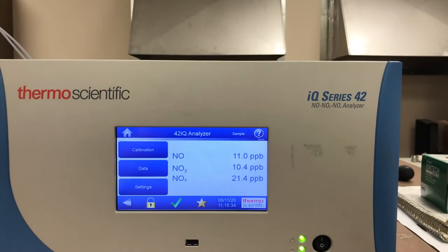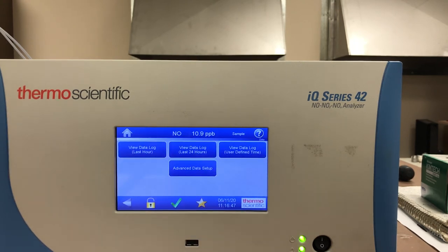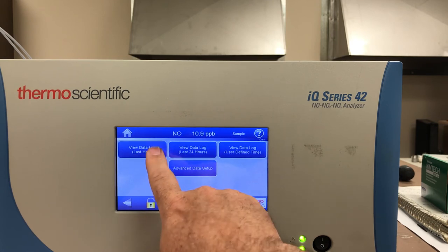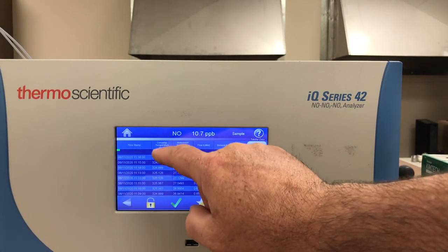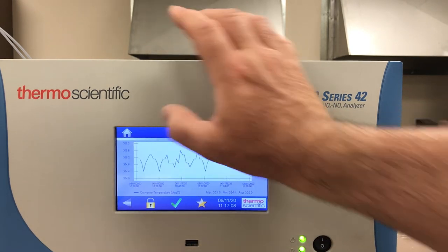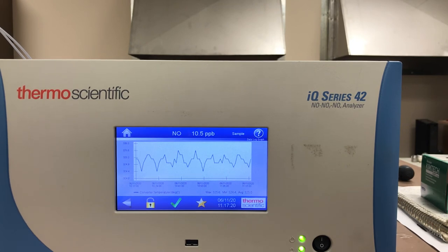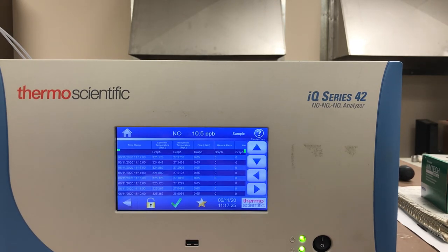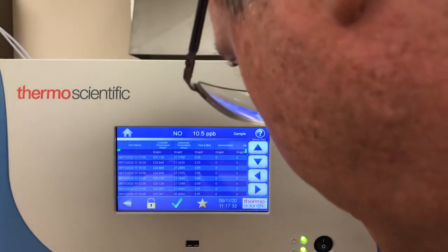On the i-Q, data can be accessed by simply plugging a USB stick into the front panel — the analyzer will recognize it right away and you can do a quick data download. To view data, simply press the data button, select view data log last hour, and it pulls up columns of data. You can also graph it: press the graph button and it actually graphs the data for you — a quick snapshot to look at diagnostic data, your readings, your high point, and your calibration during a high/mid/low cal. That graph shown here is instrument temperature.